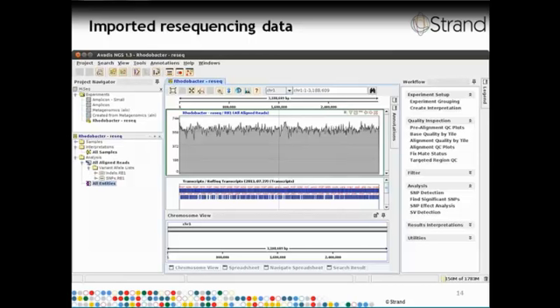Once the data is present inside the tool, we can carry out further downstream analysis. One main filtering step is to identify SNPs which are having an effect on protein function. So Avadis NGS includes a SNP effect analysis workflow step. When we click on that particular workflow step, it asks which of the different effects we wish to identify. By default, it assumes we are interested in identifying all the different SNP effects.